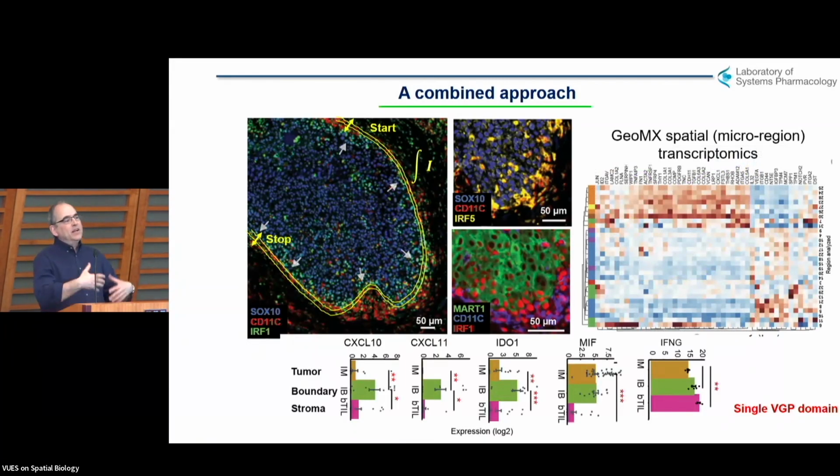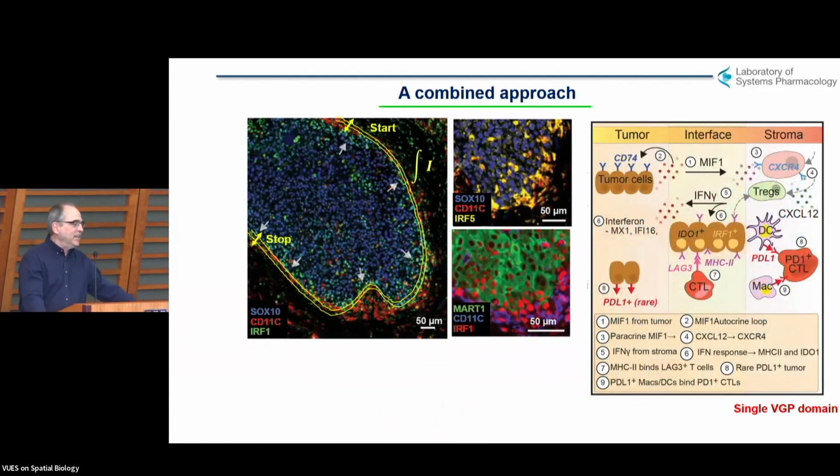And if you now take that piece of knowledge and you integrate it into a gene expression profile, and we've done this by a micro-regional approach, you can actually see statistically significant upregulation of gene expression proteins in this particular environment. So there's a whole bunch of biology in here that I won't take you to. You know, it's biology when it's a bunch of circles with arrows.